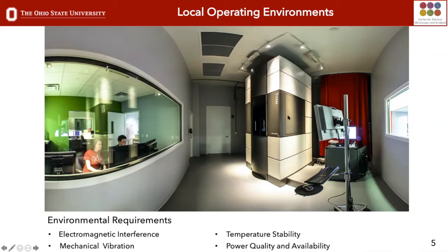Thermo Fisher provides a box whose goal is to provide these protective services, but the box can't do enough. And so we put it in this room, and this room is another layer of protection. It's sitting on a pad. You can see a cut in the floor here. This pad is isolated. The temperature is maintained. That's what the curtains are for.